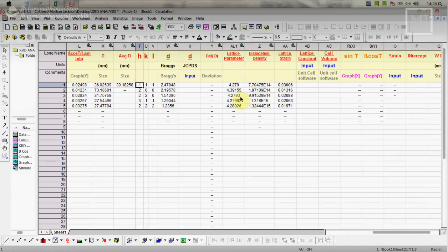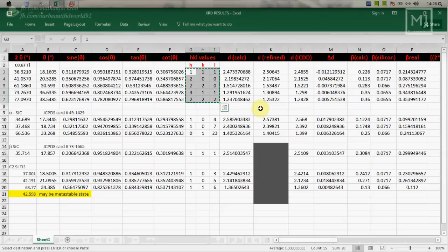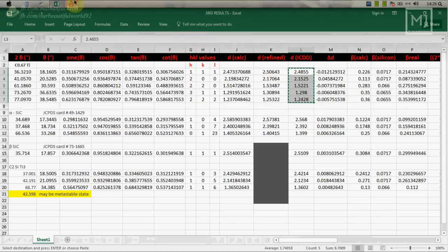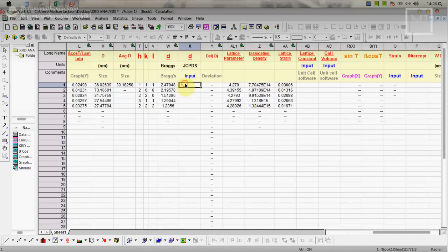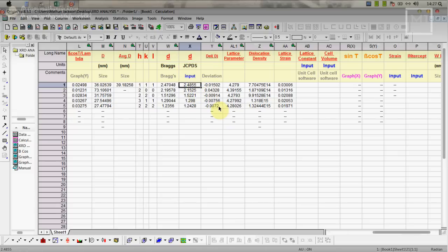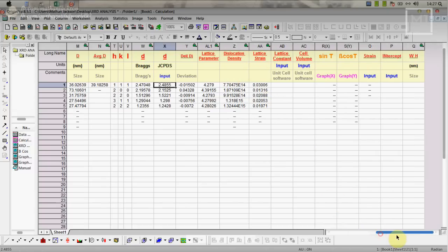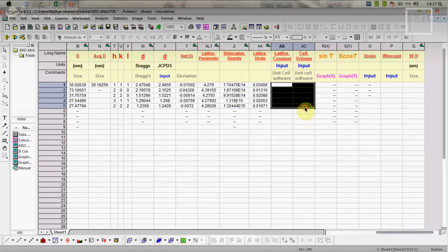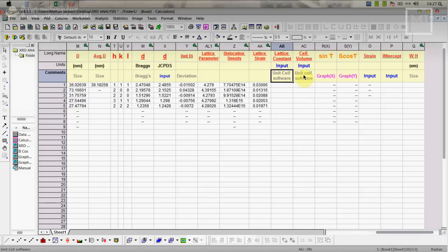Through this we obtain lattice parameter. Next thing is D from JCPDS. Copy this and paste it here. Those values you have to obtain from JCPDS. Basically we can get it from the JCPDS along with this information. Next thing is deviation, how your value is getting deviated from the JCPDS. That value is here. Next is lattice parameter, dislocation density, lattice strain, everything came.